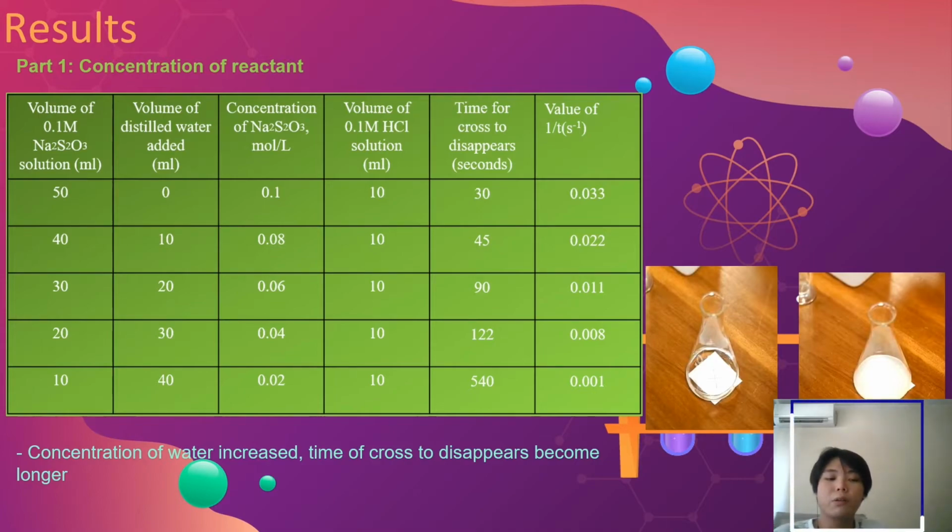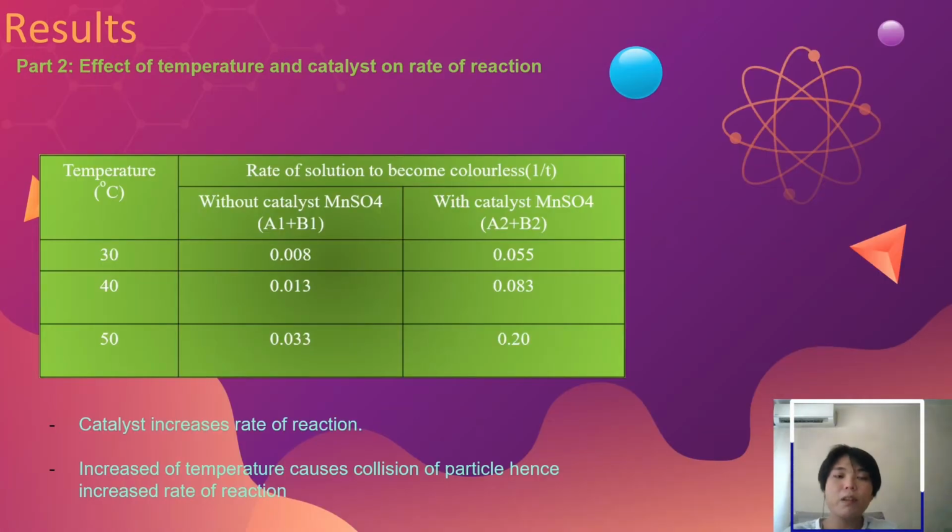Hence, it can be concluded that as the concentration of water increases, the time for the cross to disappear becomes longer. So for the next presentation, it will be the effect of temperature and catalyst on the reactions.